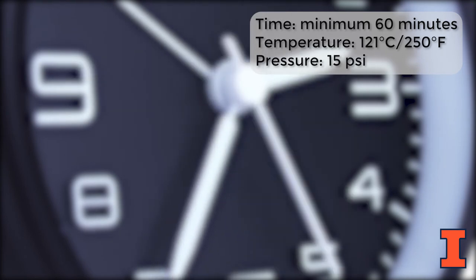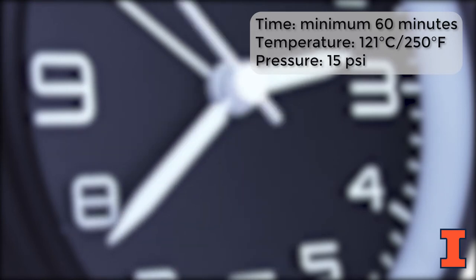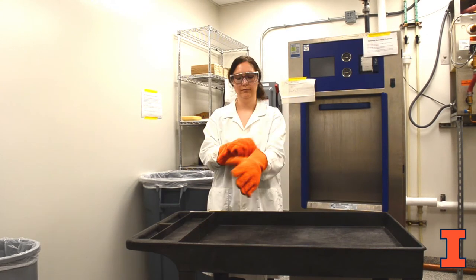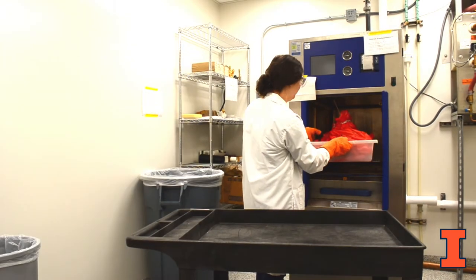Autoclave the material for a minimum of 60 minutes at 121 degrees Celsius or 250 degrees Fahrenheit at 15 psi. An initial test run will determine if additional time is necessary depending on the load size and autoclave used. After the cycle is complete, wear PPE including heat resistant gloves, lab coat, and safety glasses. While opening the autoclave, face away to avoid steam exposure.